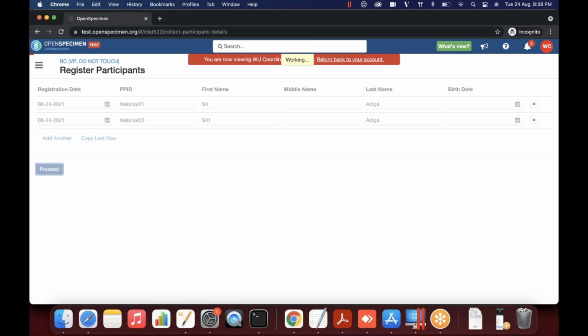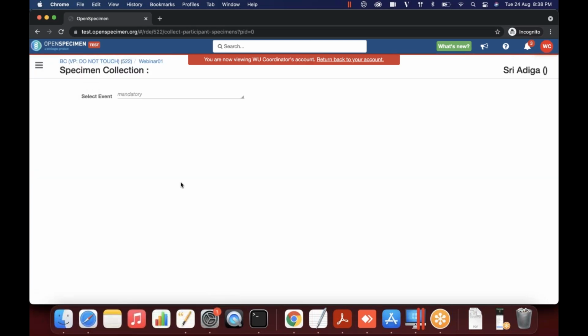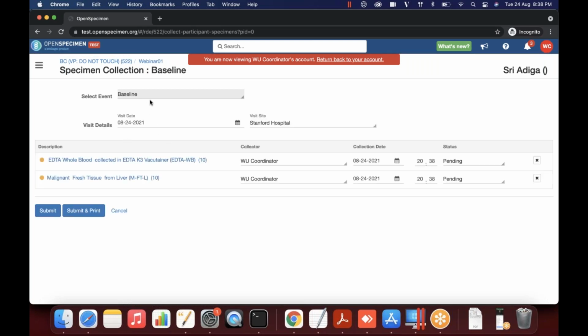So now when I say proceed, I'm directly taken to a page where I can select which visit, which event I am collecting specimens for, for webinar 1 user. So this is the first user I'm collecting. You see here that it is webinar 01.